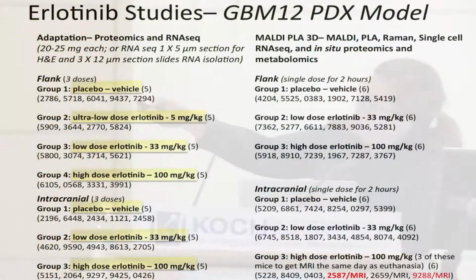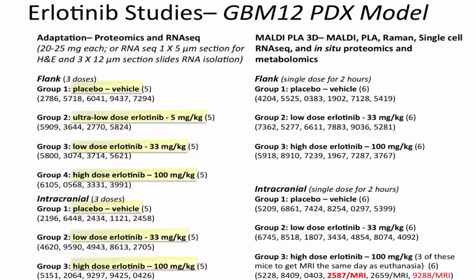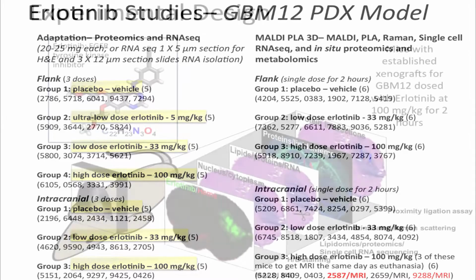And then we also did a series of animals with just 1 single dose for 2 hours to be able to acquire some of the spatial information on those animals and see if we can make a correlation between the response here to mapping into the tissue. And then I'll take you into detail.